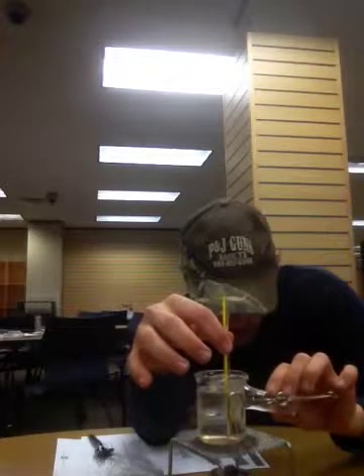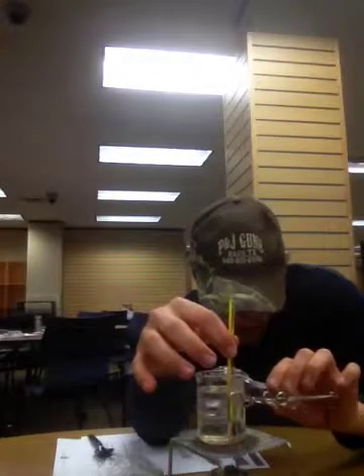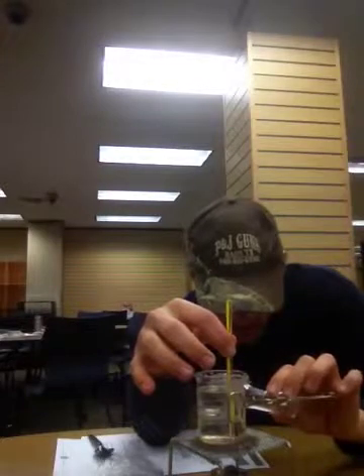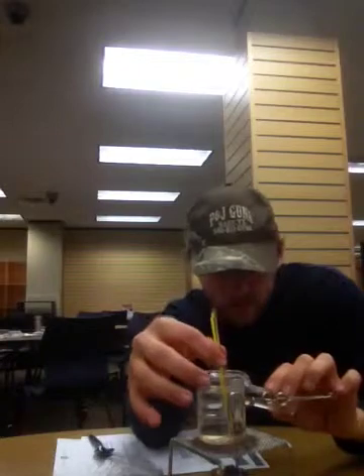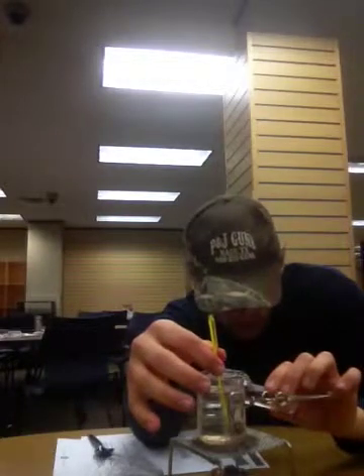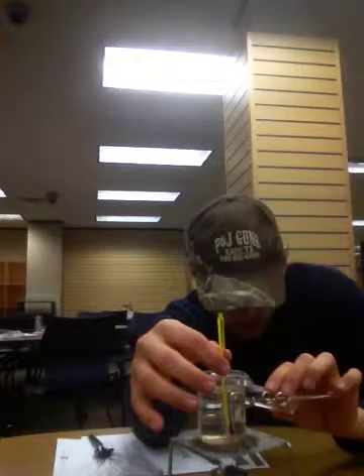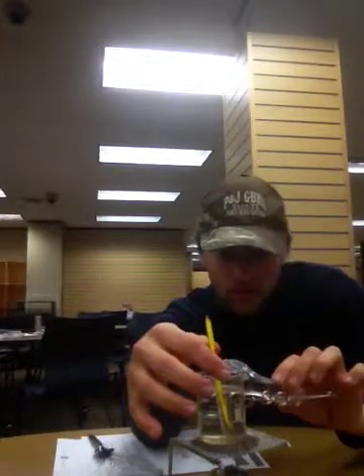And I will gently watch for it to begin to melt, which is not happening. Okay, it begins to melt at 32 degrees Celsius, the start of the melting point.